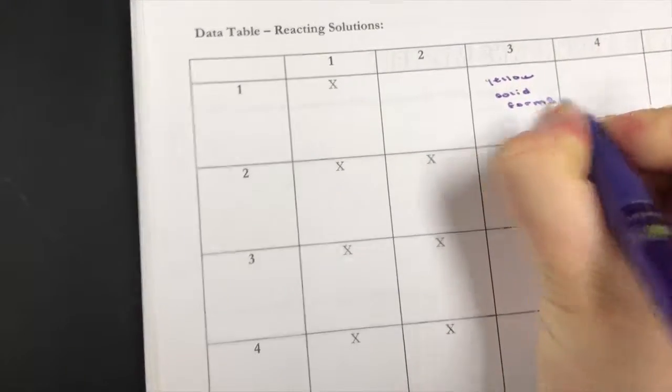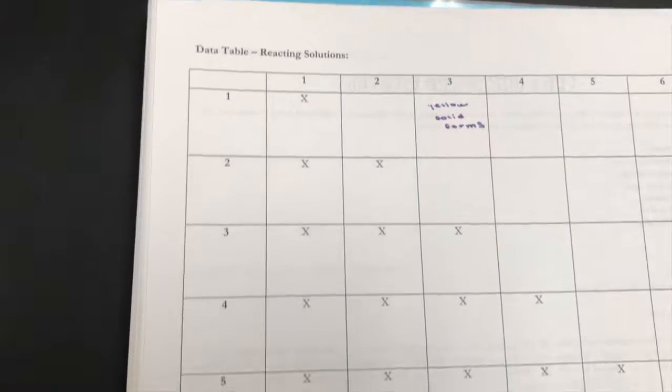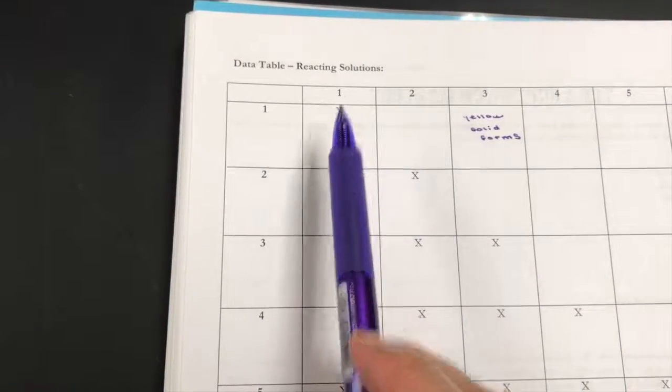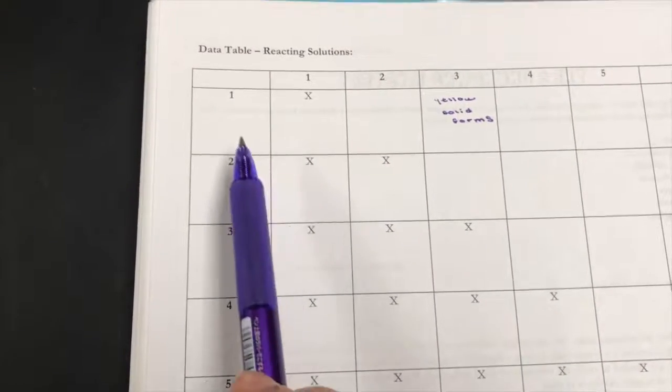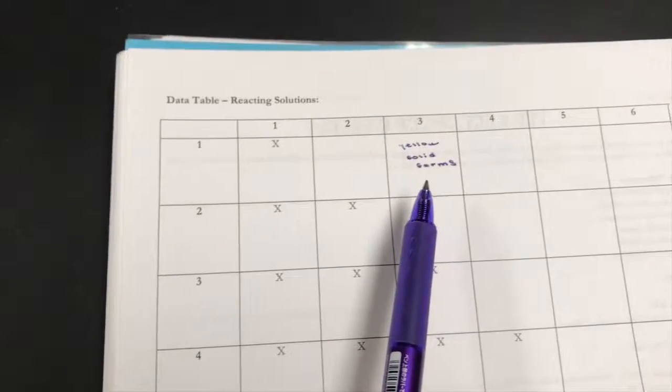Notice one and three here is crossed out. That's simply so that you're not doing the same thing twice, the same reaction twice.